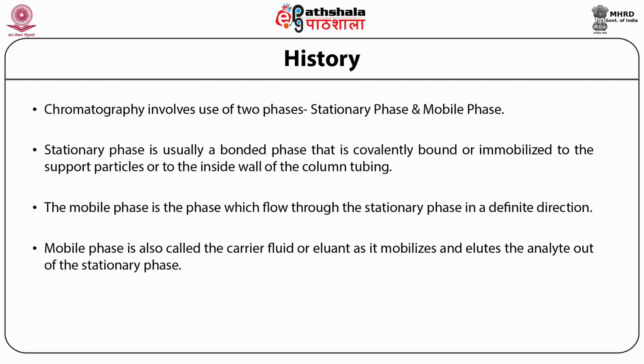The chromatographic separation is visually assessed through a chromatogram. If the separation is optimal, different peaks or patterns on the chromatogram correspond to different components of the separated mixture. The characteristic time taken by a particular analyte to pass through the system, that is, from the column inlet to the detector under set conditions, is specific and characteristic of an analyte and is known as the retention time.